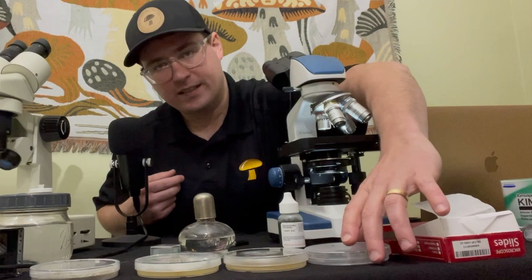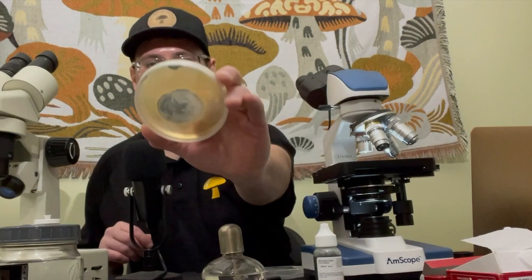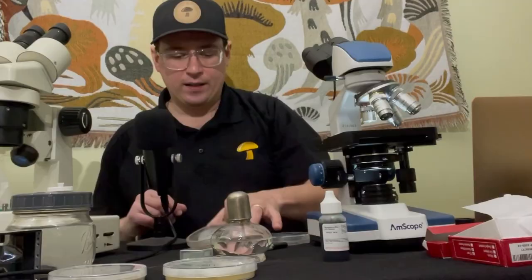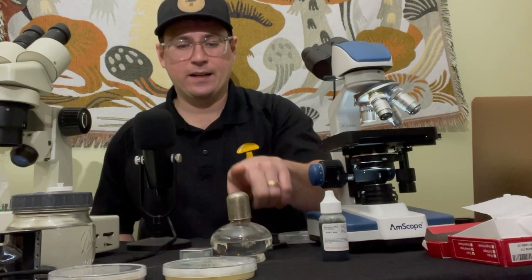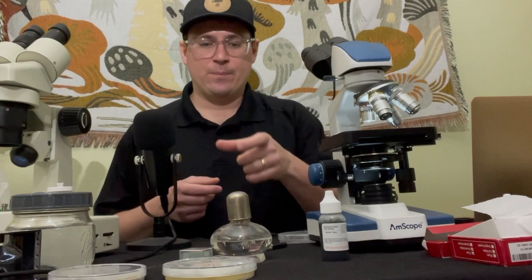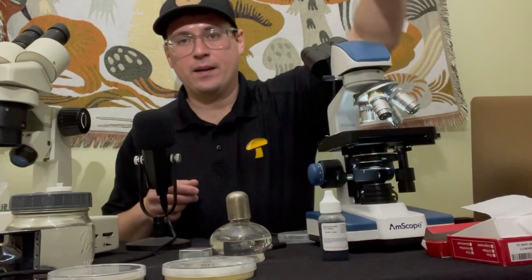I've got this lion's mane spore print, so I'm going to do a wet slide prep with that one. And then I've got some penicillium mold, so I will do a fixed slide or a heat fixed slide. That's why I have this alcohol burner here — once you transfer the mold onto the slide, you can use the alcohol to flame it so it's stuck to the slide. Then I can use the oil immersion lens with some oil for my oil immersion.